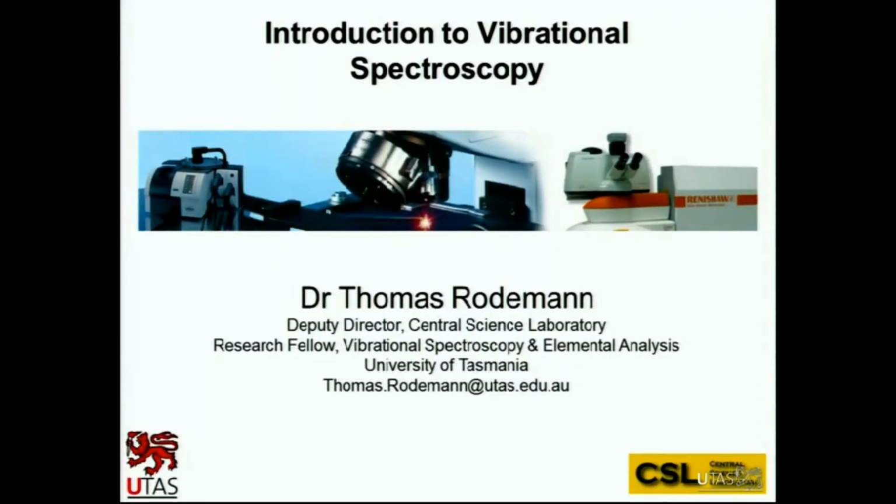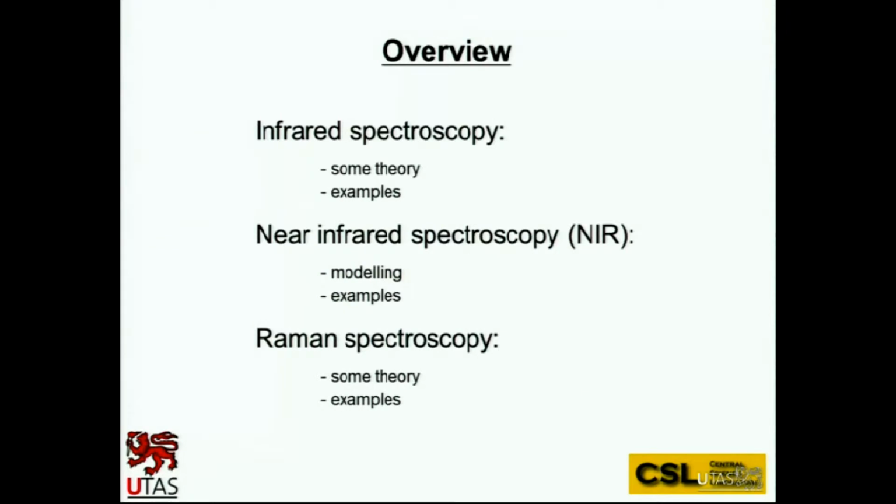I'm Thomas, and I look after the Vibrational Spectroscopy facility in the CSL. We actually have a few different spectrometers in the facility. We have infrared spectrometers, near-infrared spectrometers, or NIR, and also Raman spectrometers. So I'll quickly go through each of the techniques with a little bit of theory and a few examples, just to give you a little bit of an understanding of what we can and can't do.